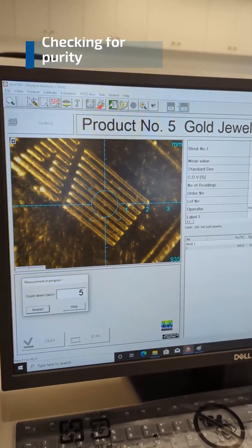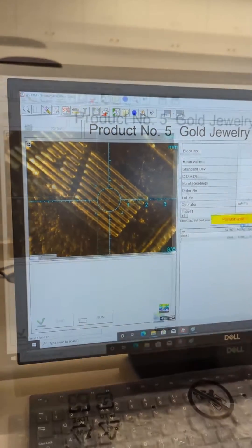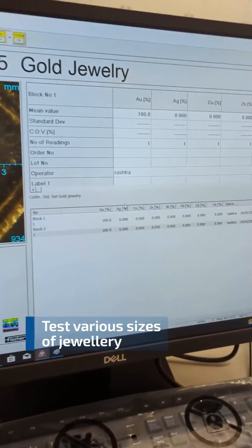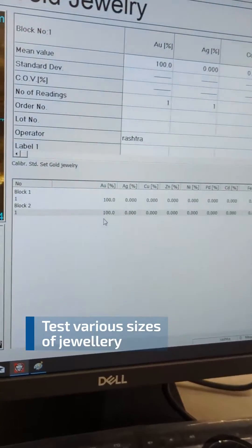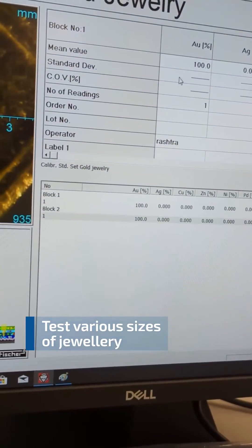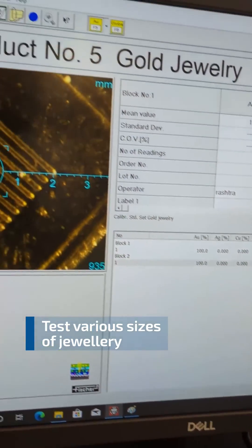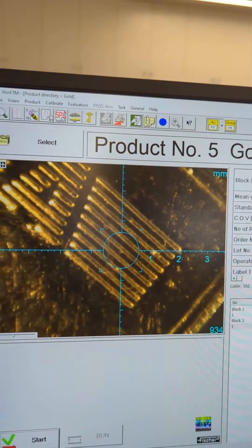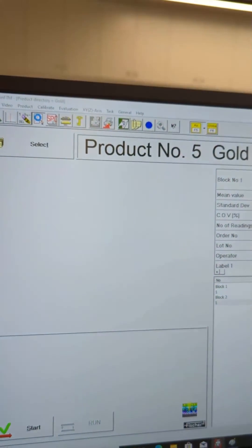Fisher Gold Scope comes in different models to suit your needs and budget. Whether you are a pawn shop, a gold buyer, a testing lab, an assaying office, a refinery, or a jewelry manufacturer, there is a Fisher Gold Scope model for you.